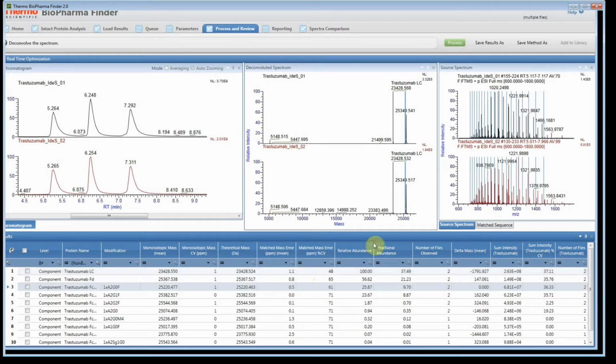One thing I forgot is that when you're running the software in manual mode, the software does not save your results. So you want to save it periodically so you capture your results, and same thing with the method, so you want to make sure you actually capture that.